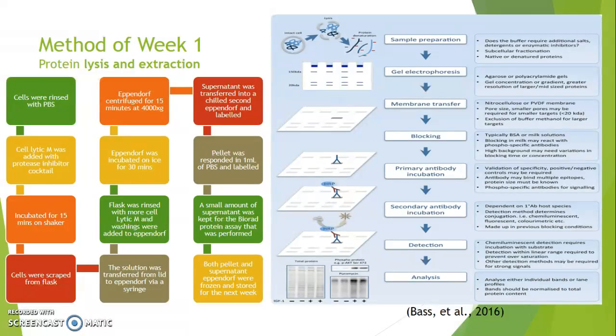Why is it necessary to block? It is necessary to block to increase sensitivity and prevent non-specific signals. What is the function of Coomassie blue stain? The Coomassie blue stain is used as a qualitative test to test for the presence of actin and to determine its molecular weight. Why is Ponceau red used?